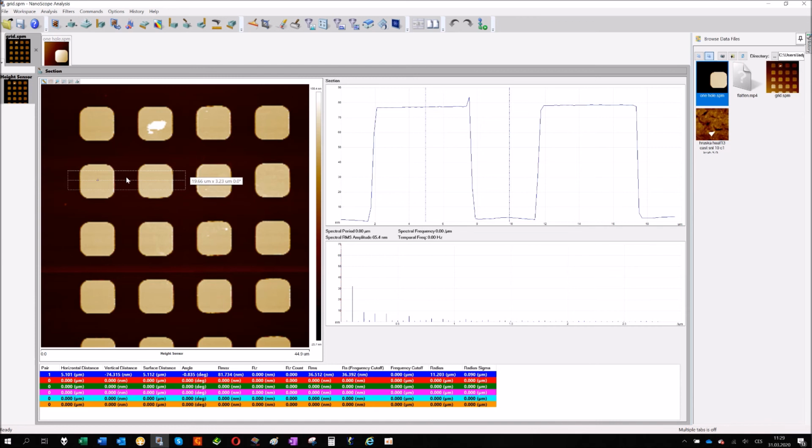You can see right now that we have sharp edges, but if I move it a little up, the edge is not sharp anymore because it's still averaging also these round edges. So this is a much better option for statistics if you want to measure, and we want to, let's say, average a few points. That's the way to change it.